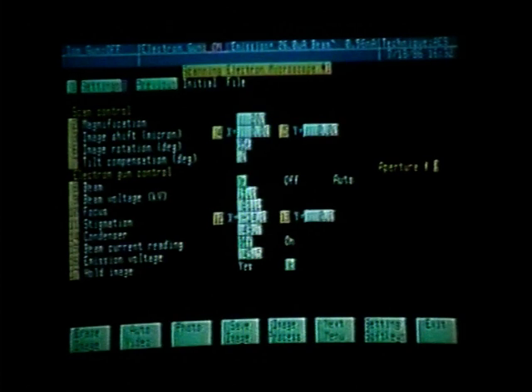We should also increase our magnification to the same magnification where we registered on the TV monitor. That was a magnification of 5000x. To re-register, we can then use the image shift, which is function key number 3, and we can move in the X direction and in the Y direction using the arrow keys located in the right corner of the keyboard. Once we have the sample registered with our registration marks, we then want to make sure it's in focus, again using the Find Focus knob located at the right of the tabletop where the keyboard is sitting on.